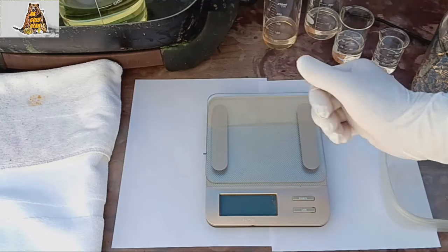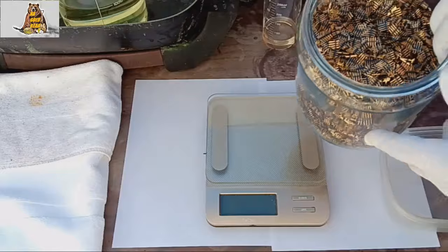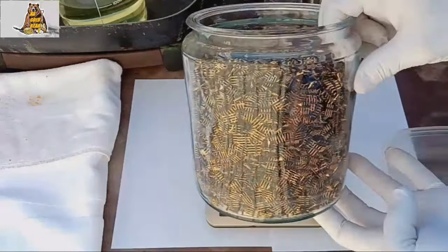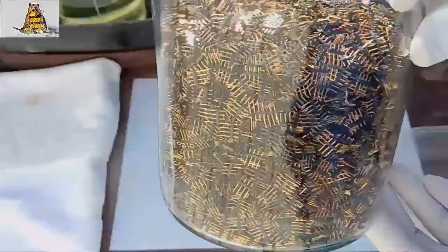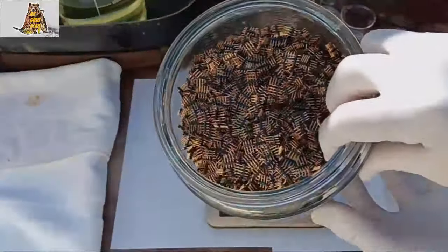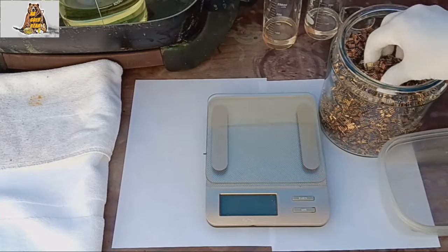Hello people! As I said in the last video, today we'll be extracting gold from these little pins. Today I want to extract gold and fill my lab with nitrogen dioxide, because my day off today is kind of boring.